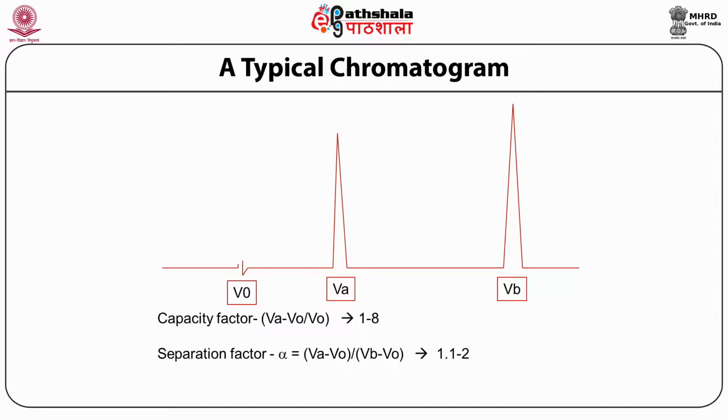When you are running an HPLC with, suppose, 1:1 methanol water, and you inject a compound like pure acetonitrile, you will get a notch. That notch shows some sort of negative deflection. It shows that the compound is coming out first, not retained in the column. That is V0, the void volume, in which you are not expecting anything retained to come out.